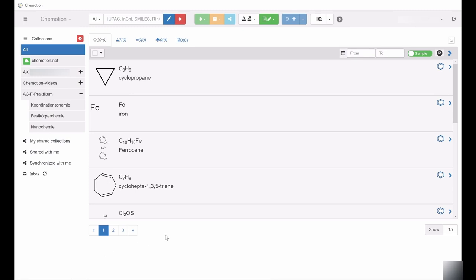Rather, it serves as a sort of backup folder where entries which are not assigned to any other collection are collected and kept. Please take this distinctive function of the All collection into account when working with the Chemotion ELN.